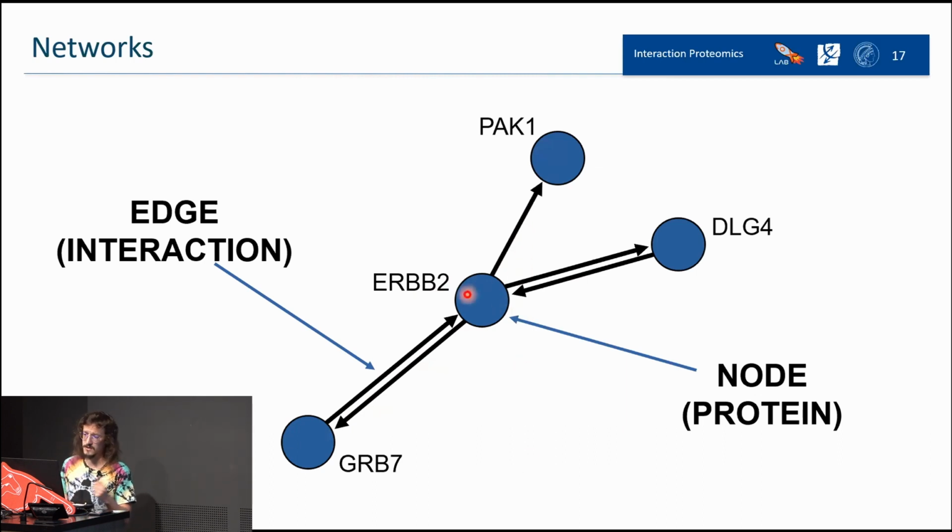This could be, for example, the substrate of a specific enzyme. So in that case, the interaction is directional. And yeah, this is a nicer way to represent everything.